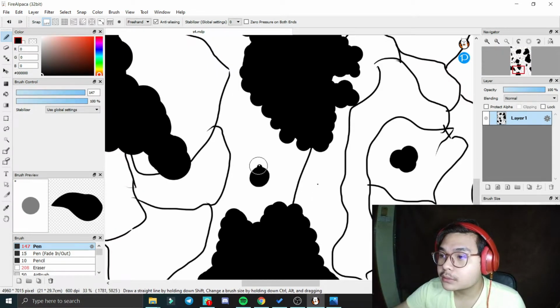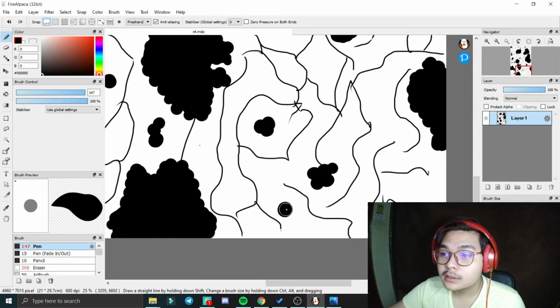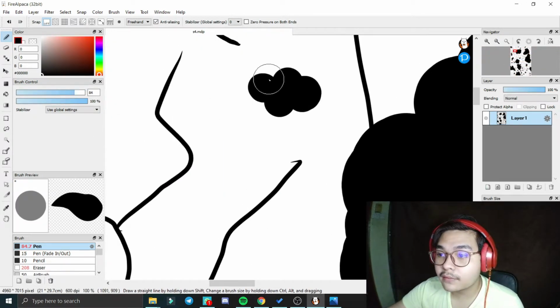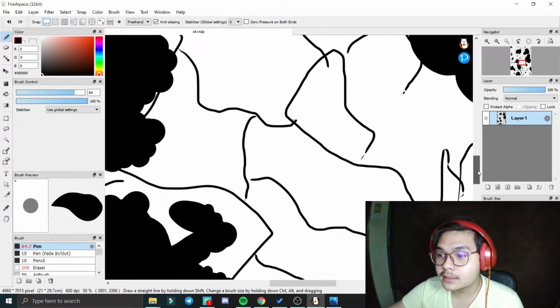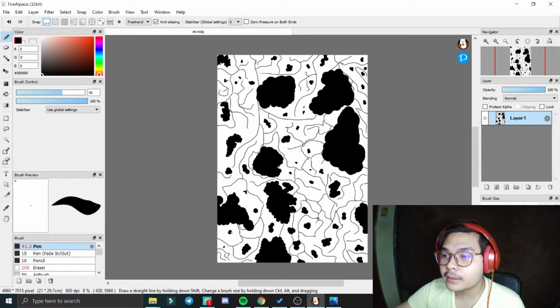Lastly, we have malleable cast iron. The dark spots are graphite rosettes. So it is similar to the nodular, but nodular graphite is spherical, while malleable graphite is not spherical. It doesn't have a consistent shape. The light region is the alpha ferrite matrix.